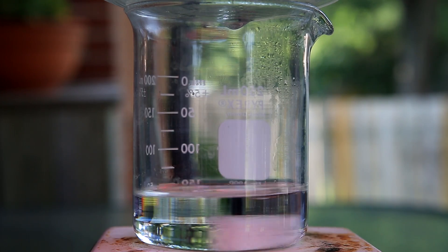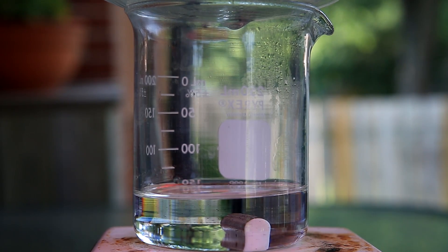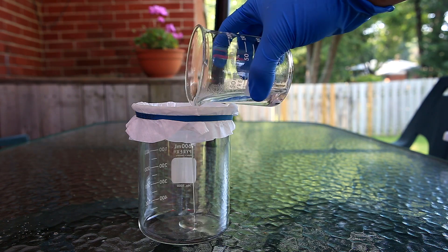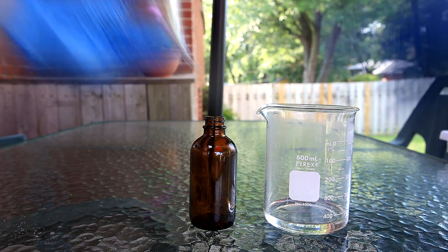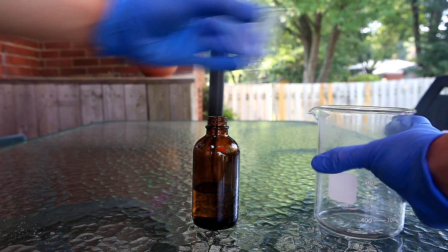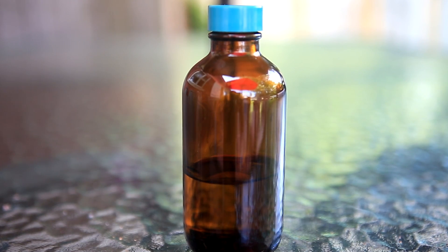When done, the solution should be clear but there might be little bits floating around. First, let it cool because you don't want to work with a hot solution. Once cool, the watch glass is removed and the solution is filtered through a coffee filter. At this point the stannous chloride solution is complete and is transferred to an amber glass bottle for storage — in the end, about a 2 molar stannous chloride solution.